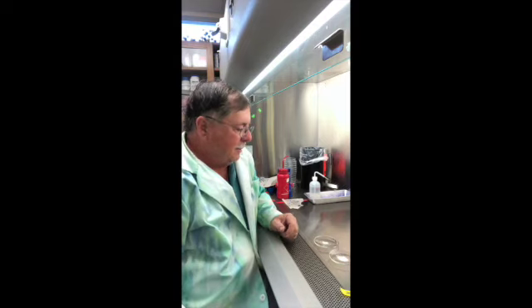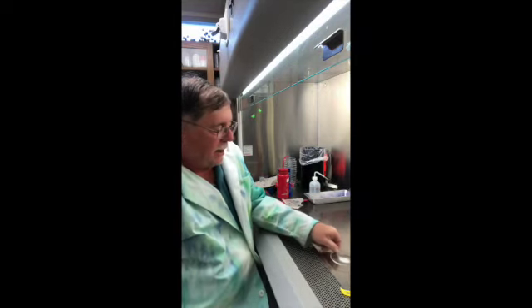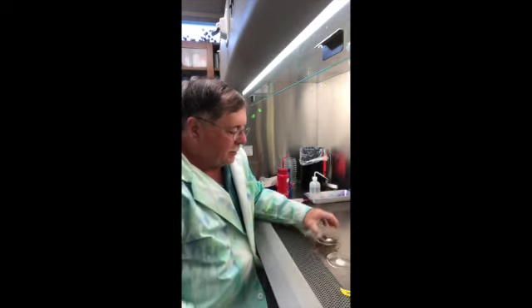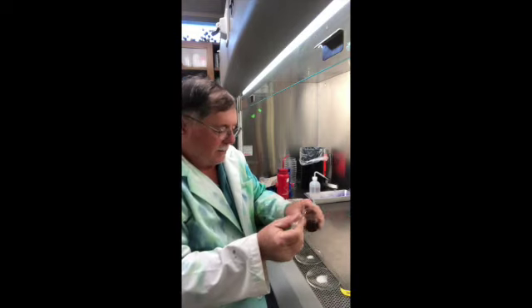We're going to take some powdered starch and some powdered glucose, and I want to just show you what happens when we mix it with some iodine. So this is Gram's iodine.